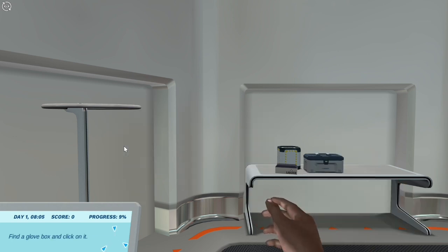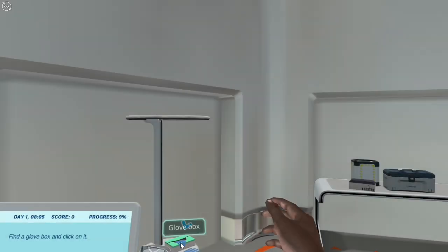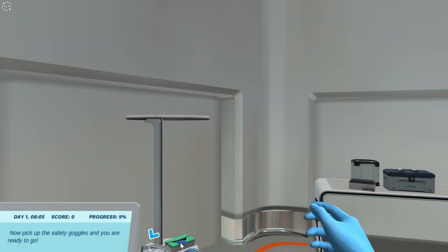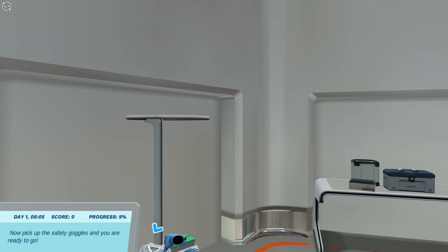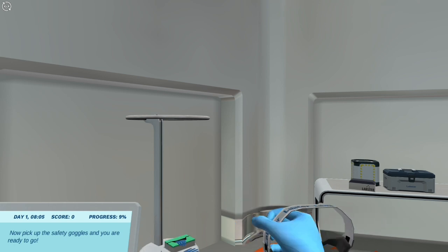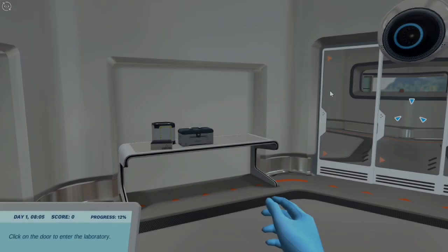Click and hold the left mouse button and find a glove box and click on it. Click and hold the left mouse button and move the cursor to the side to rotate the camera. Now pick up the safety goggles and you are ready to go. Click on the doors and enter the laboratory.